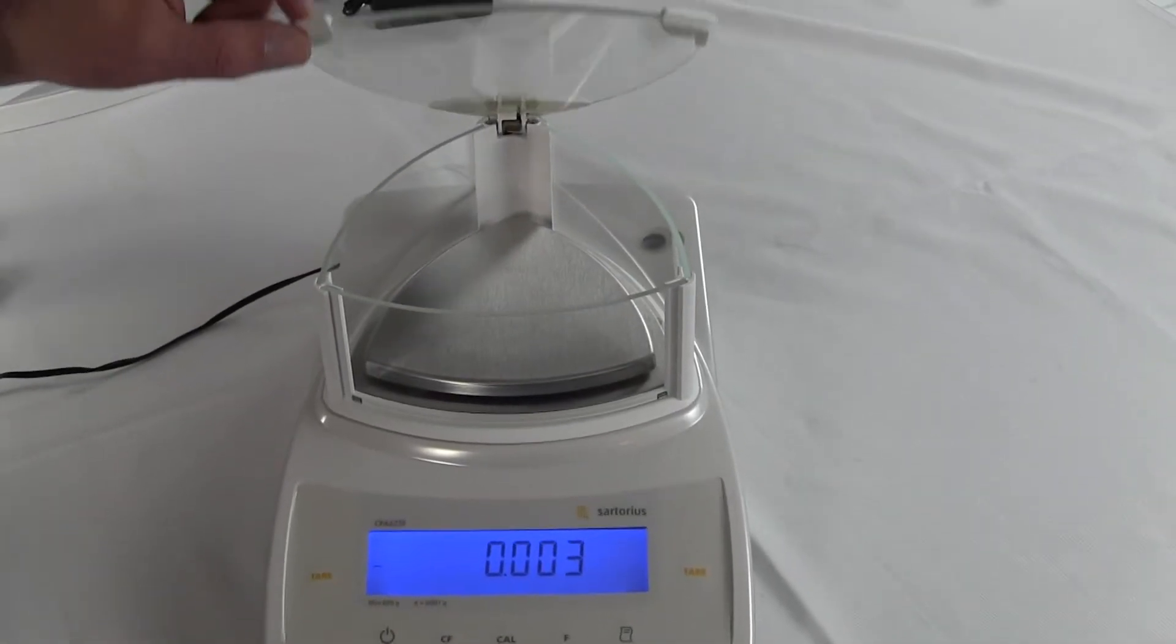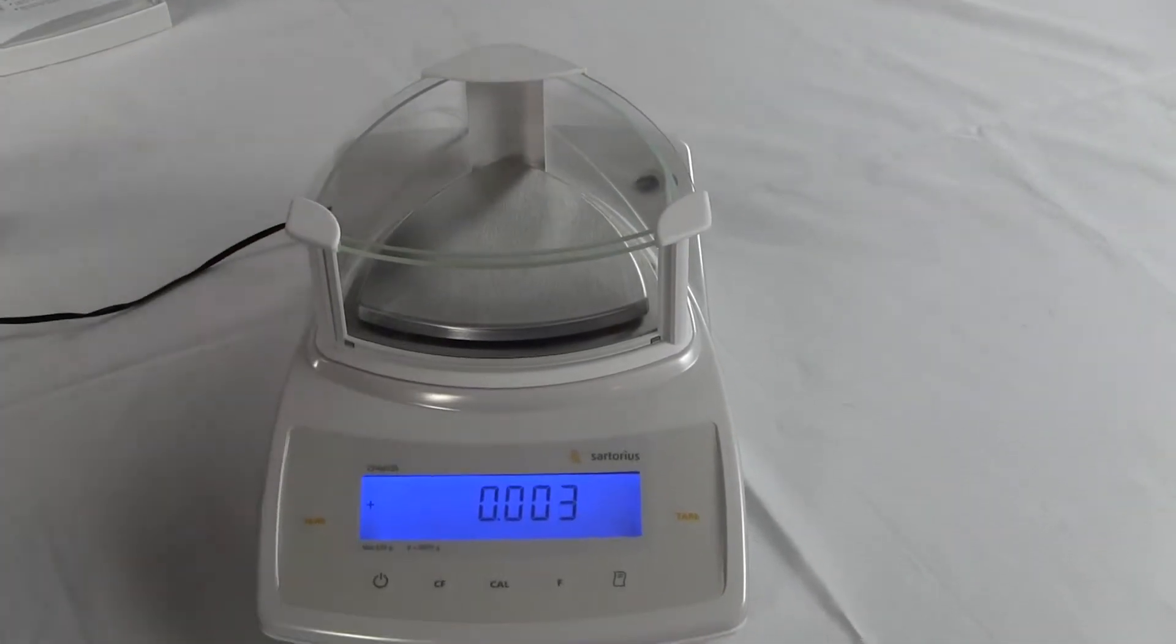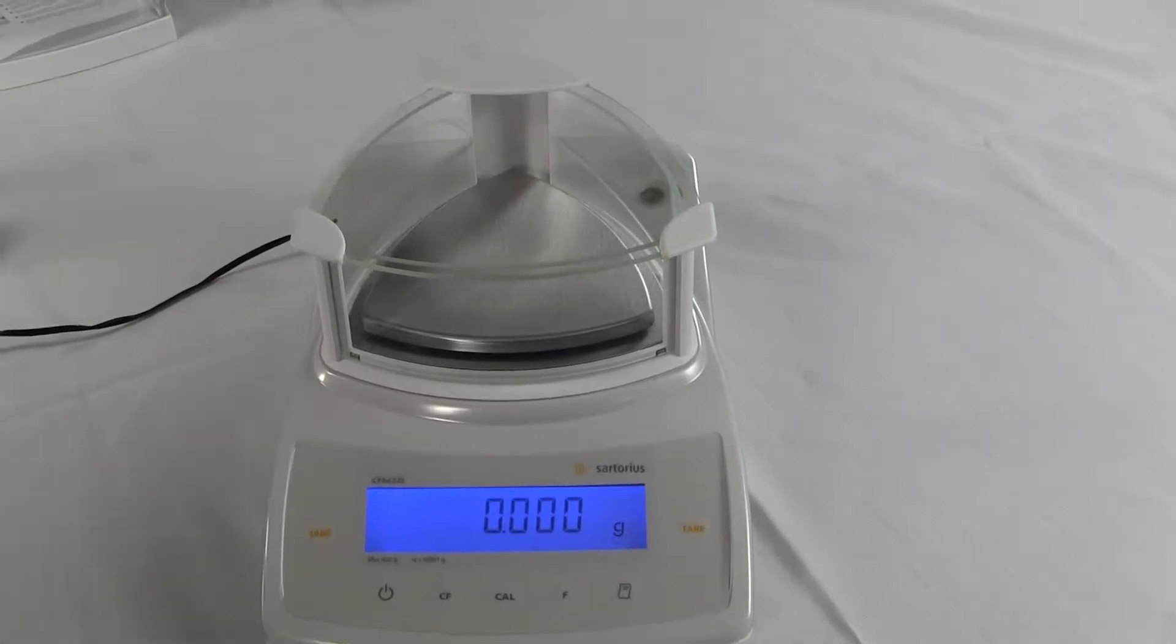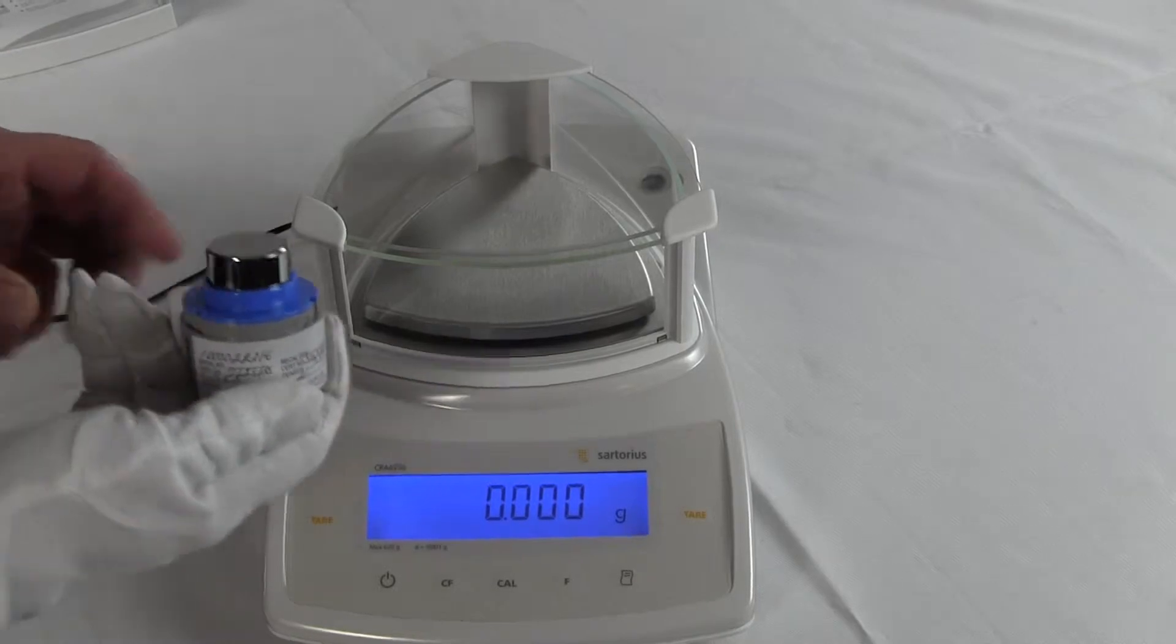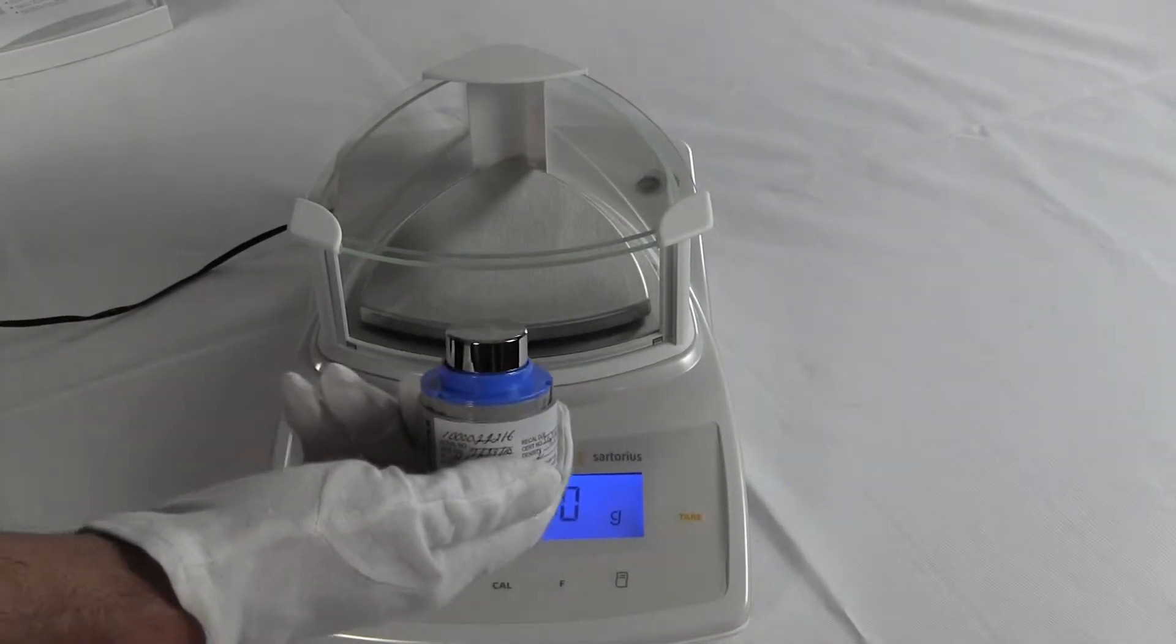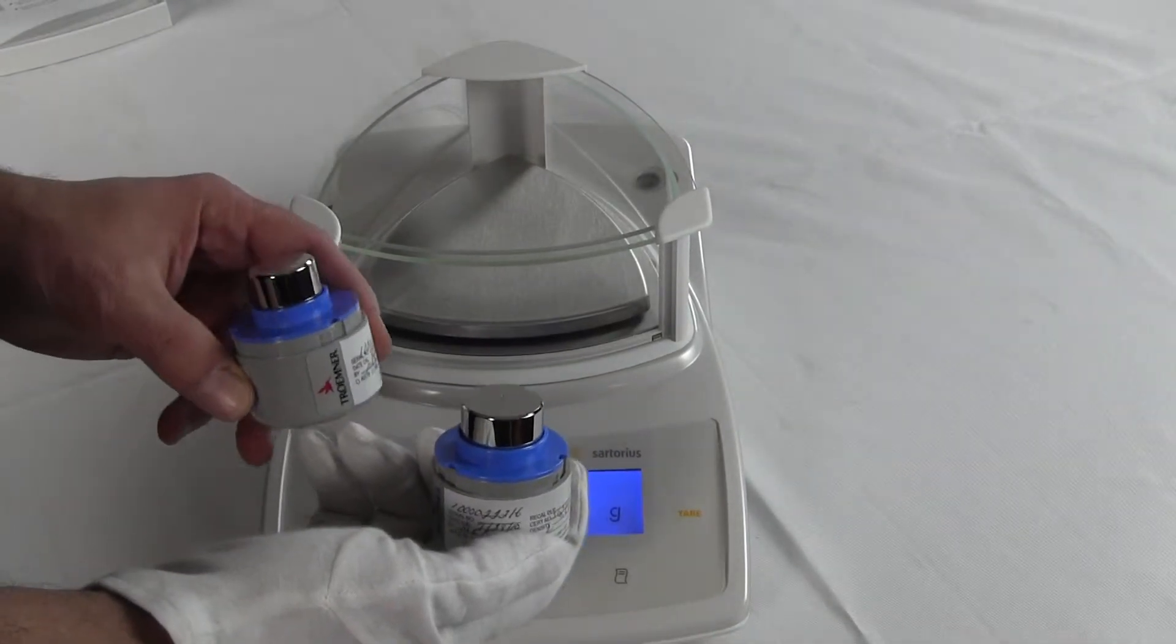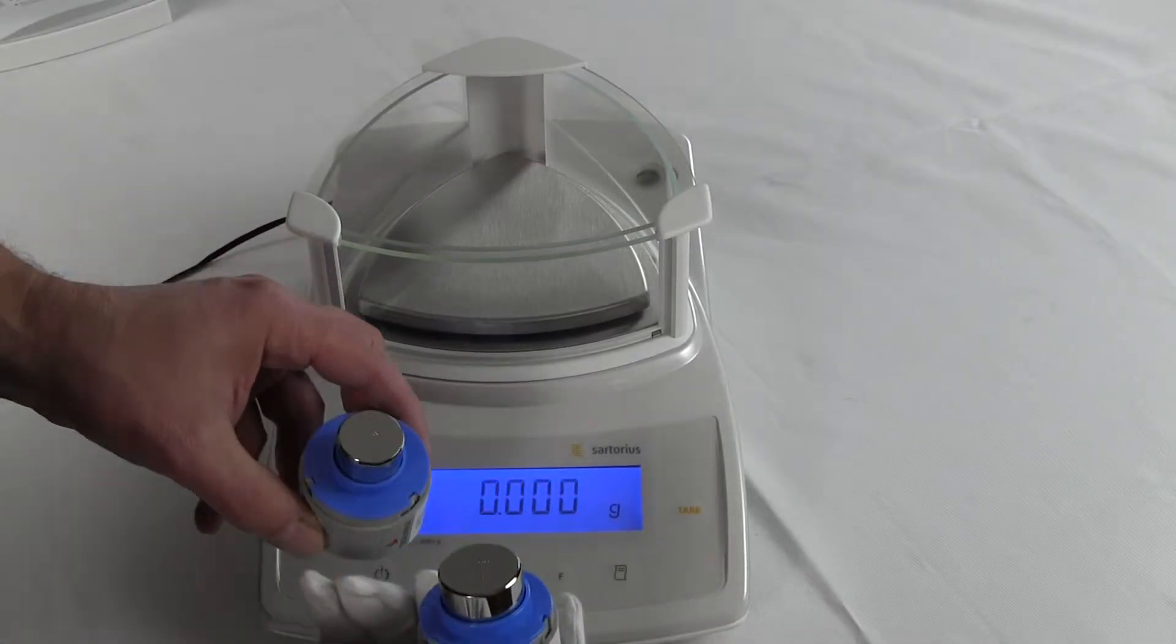The door flips up. Now this scale is a three-decimal place balance. It has motorized internal calibration. I do have some calibration weights here. This is a Class 1 200 gram weight and I also have a Class 1 100 gram weight.